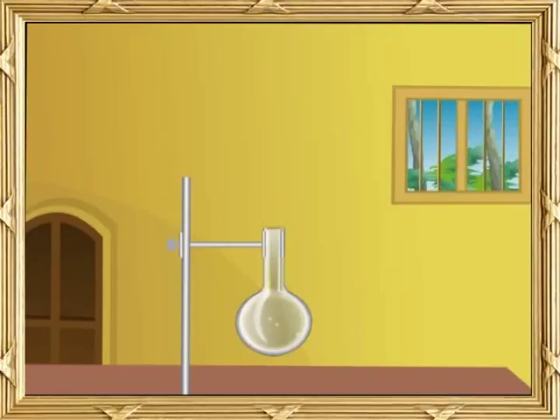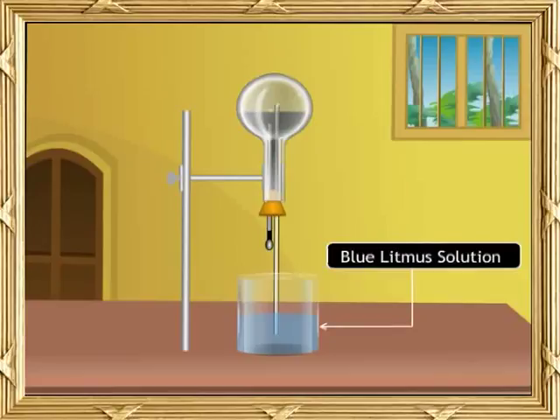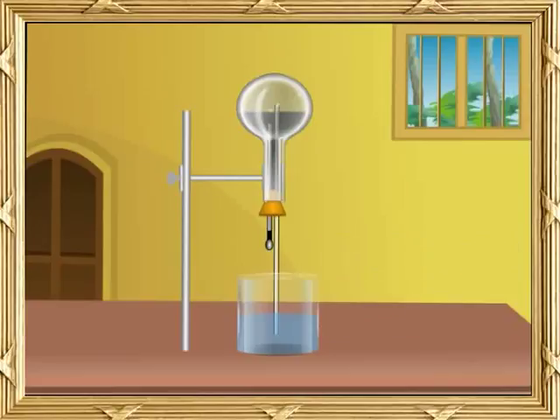See, the round bottom flask is filled with sulphur dioxide. This is a jet tube. Dip the bottom end of the jet tube in blue litmus solution. The ink filler contains water. Now, press the rubber cover to release water.